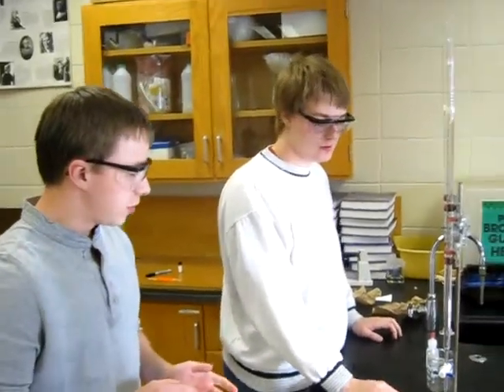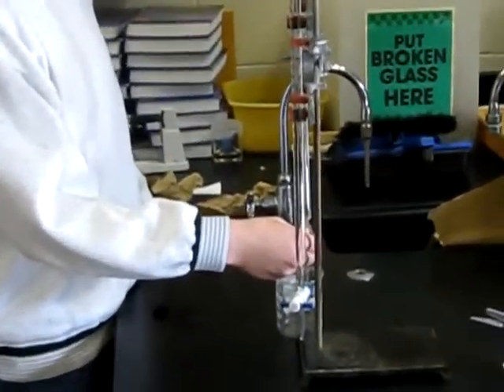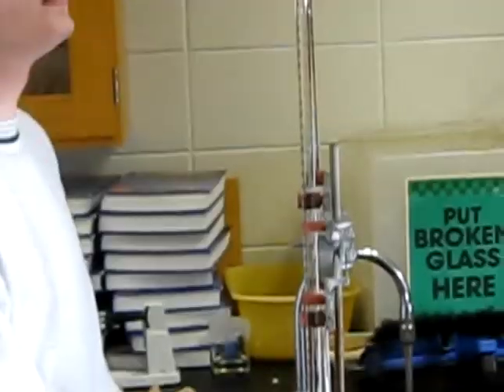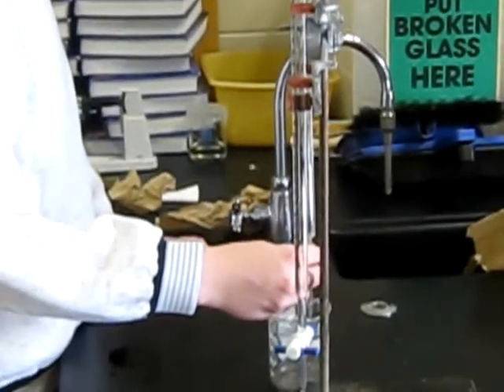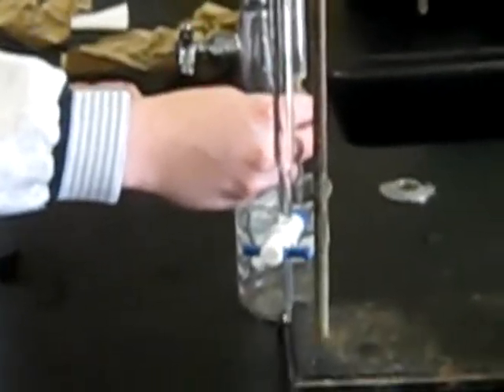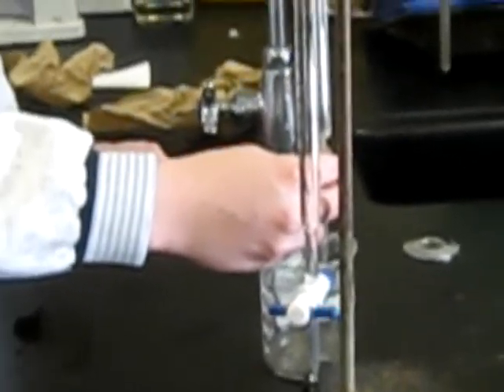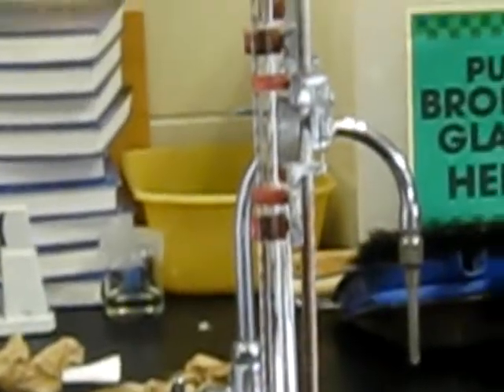My partner here is going to begin adding 10 milliliters of acid into the beaker. 15.4. Okay. We want to be very careful that we only add 10, and we want to make sure that we write down exactly how much we add in.